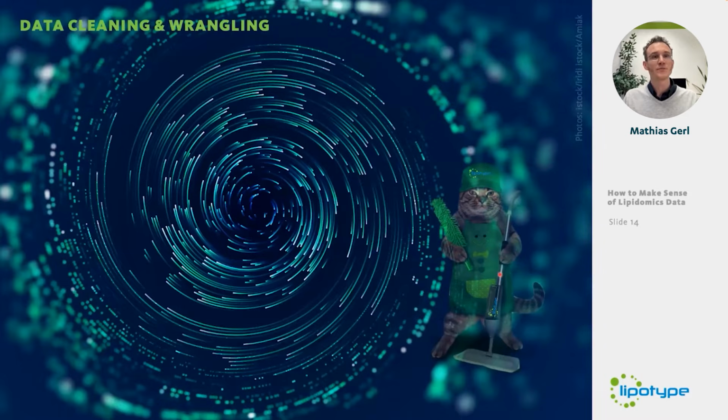And the idea is, you first have to prepare your data in order to apply whatever algorithms or methods you use later. This is often a lot more than you think, and the bulk of the work that you do, but it's largely unseen later. So you're gonna only see later the fancy method that you use, but not the wrangling, but it might take much more work than you think.